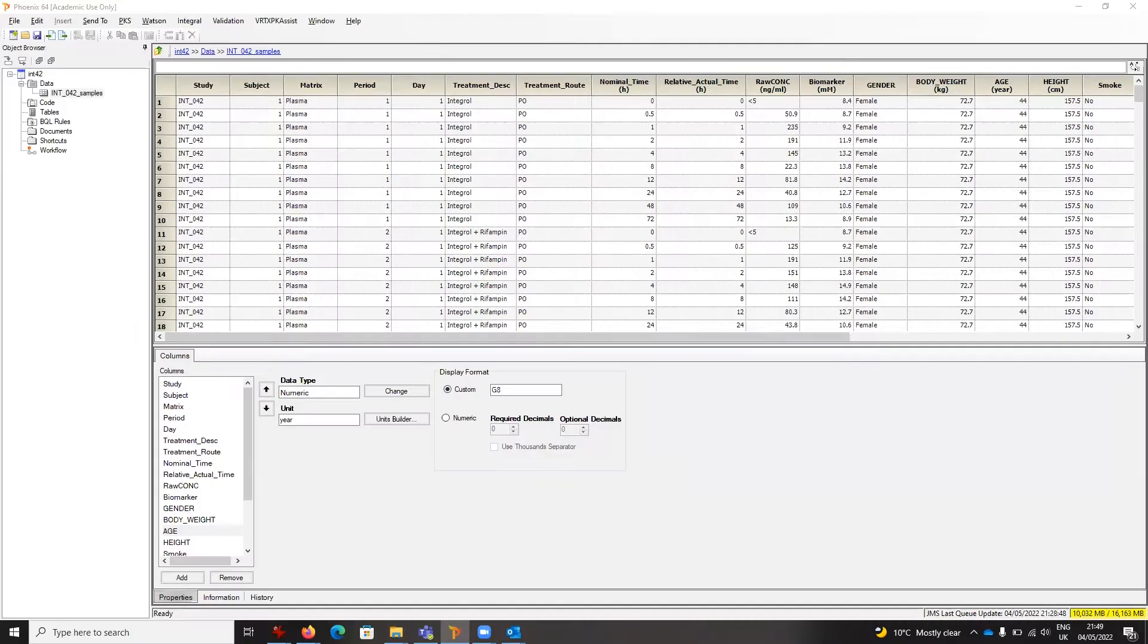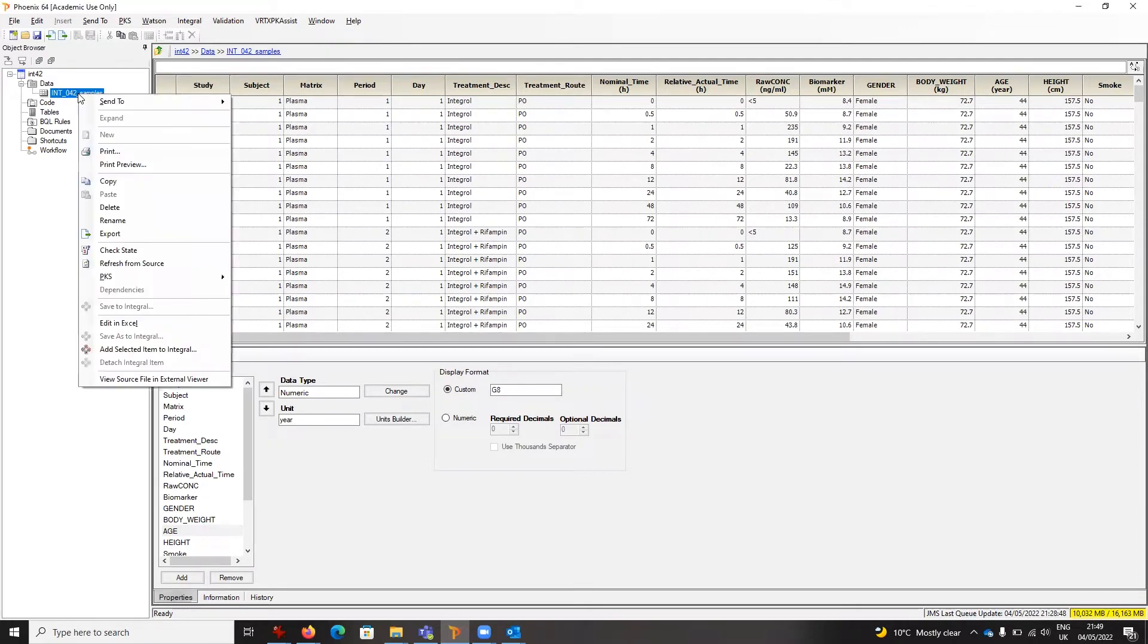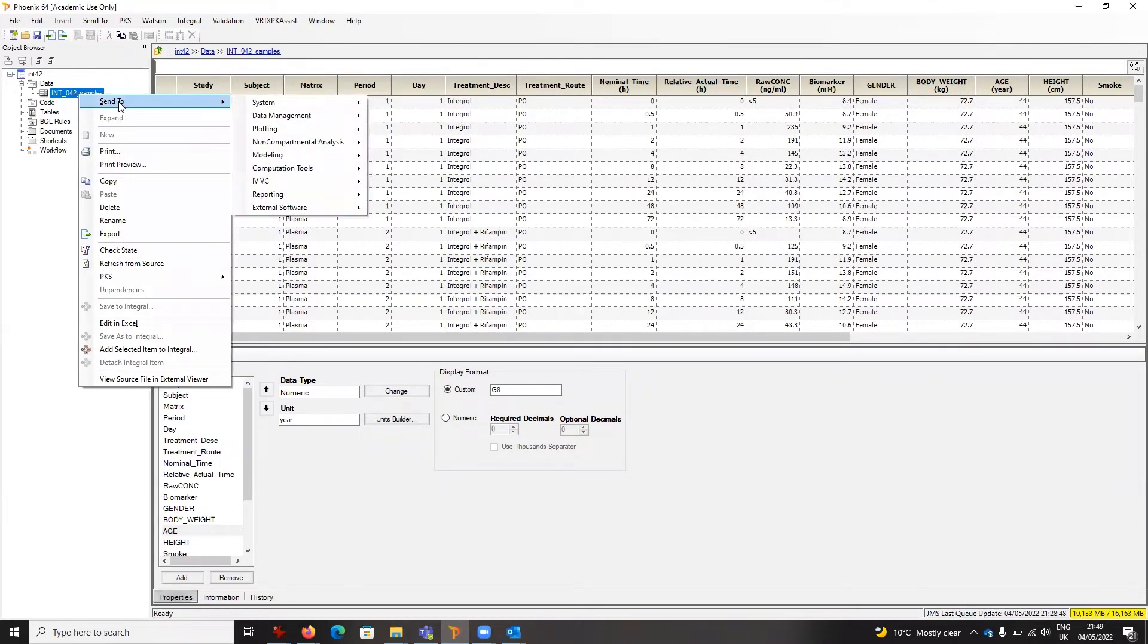Here we are within Phoenix. I already have a project open that has data from a simple crossover study. If I want to plot that, normally what I would do is take my worksheet and send it to plotting.